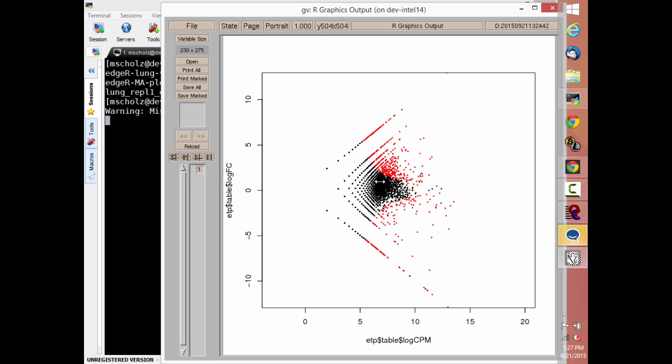So if you were going back to basic principles of do something to get other people off of your back, the first place where you can do that when you get sample data, somebody will say, well, you have sample data, what have you done? You can make your FastQC report and hand it to them and say, I did this. And then they'll leave you alone for about a week, and then they'll come back and say, well, now that you have all your data trimmed and your QC done, what else have you done? And you can show them this chart. And say, this is a chart of my differential gene expression. Which it is.